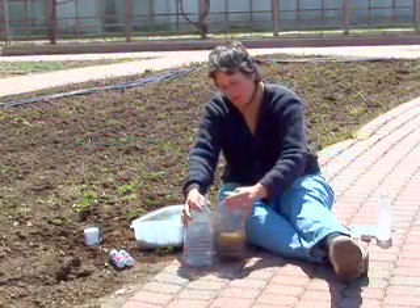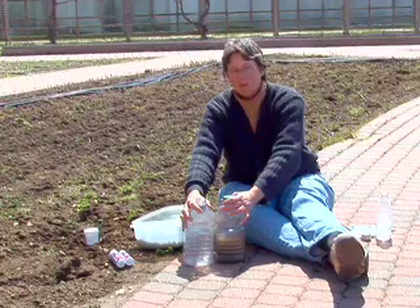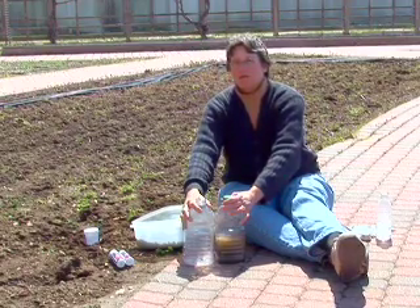This is a sample that I ran at home to determine the soil texture, which is the amount of sand, silt, and clay in the soil. That will tell you a little bit about your soil's drainage and water retention capabilities.